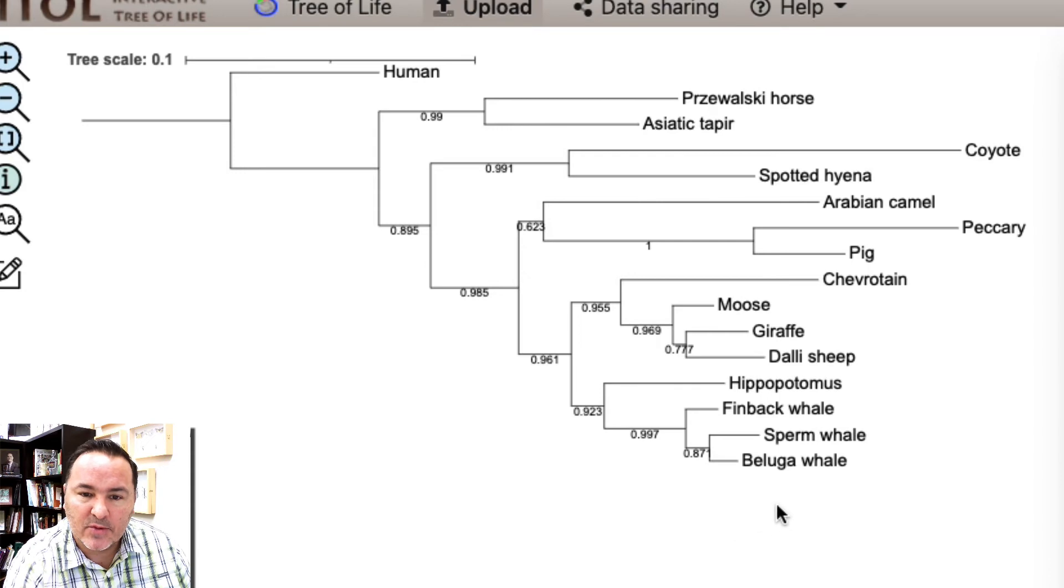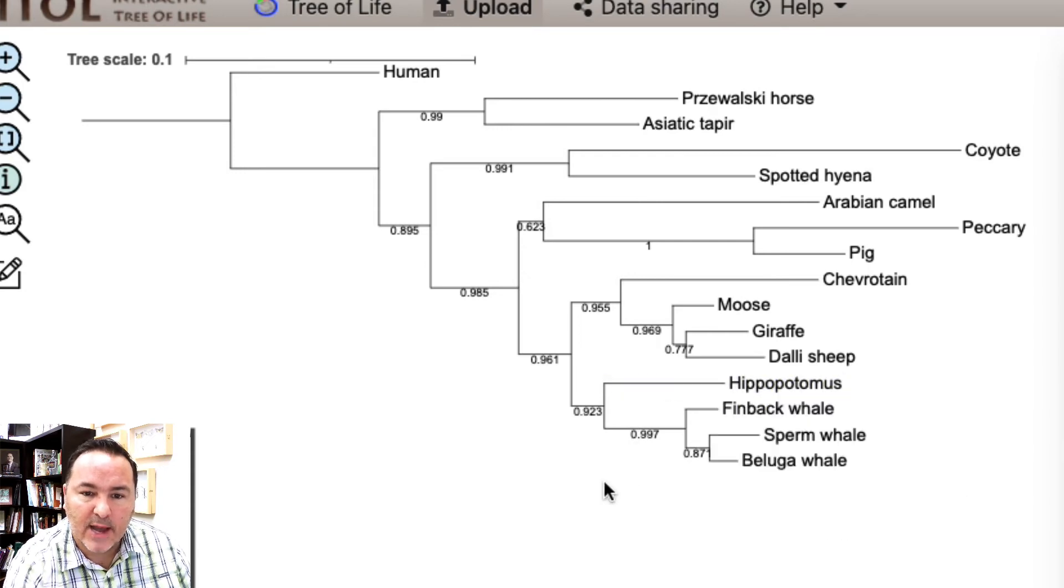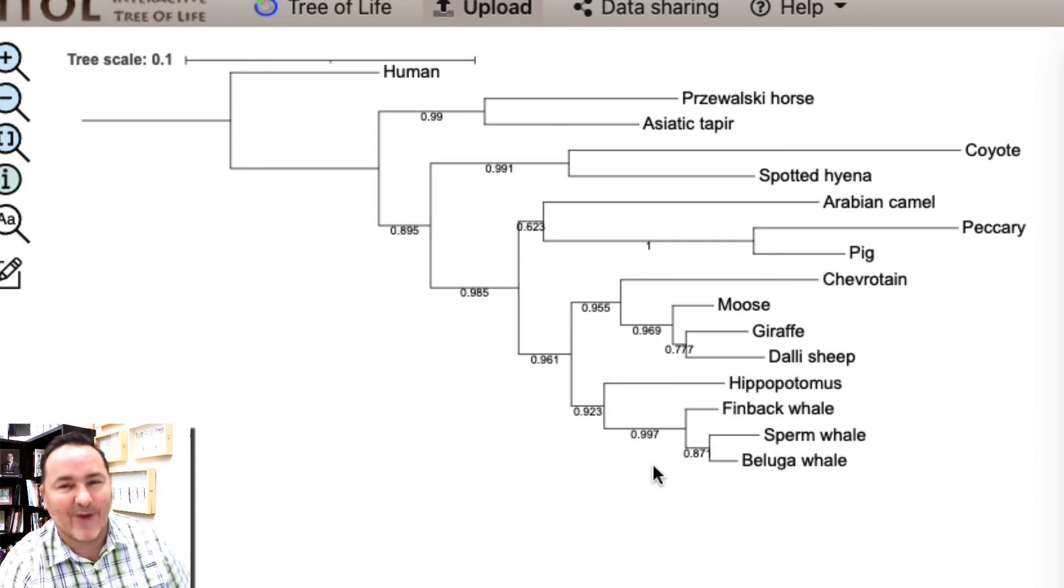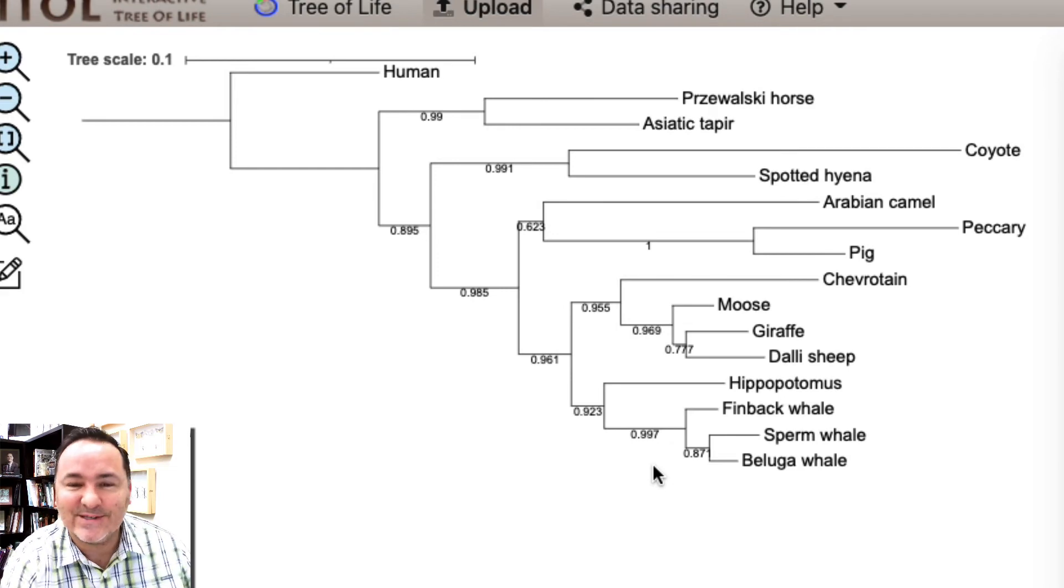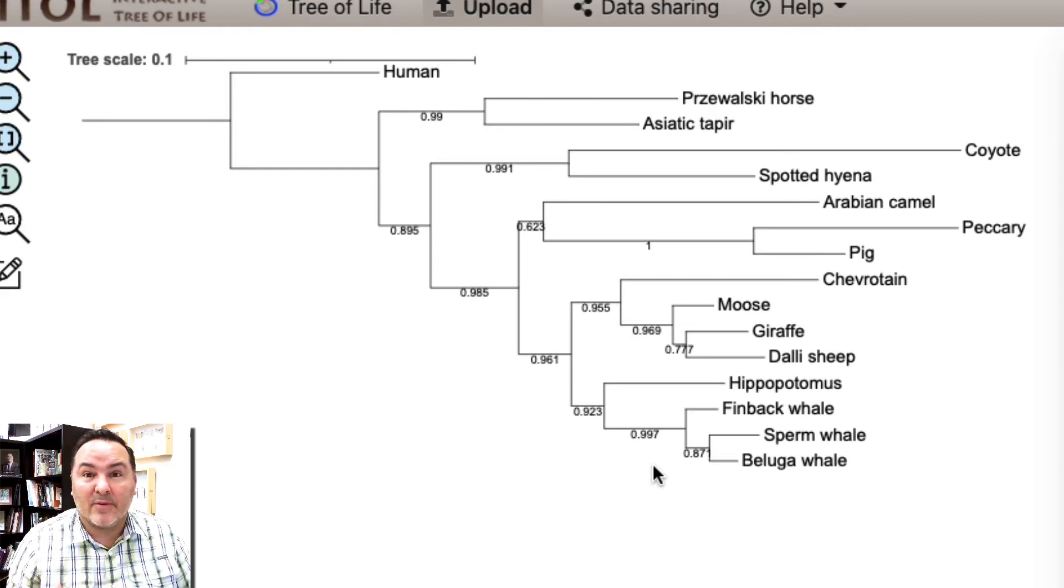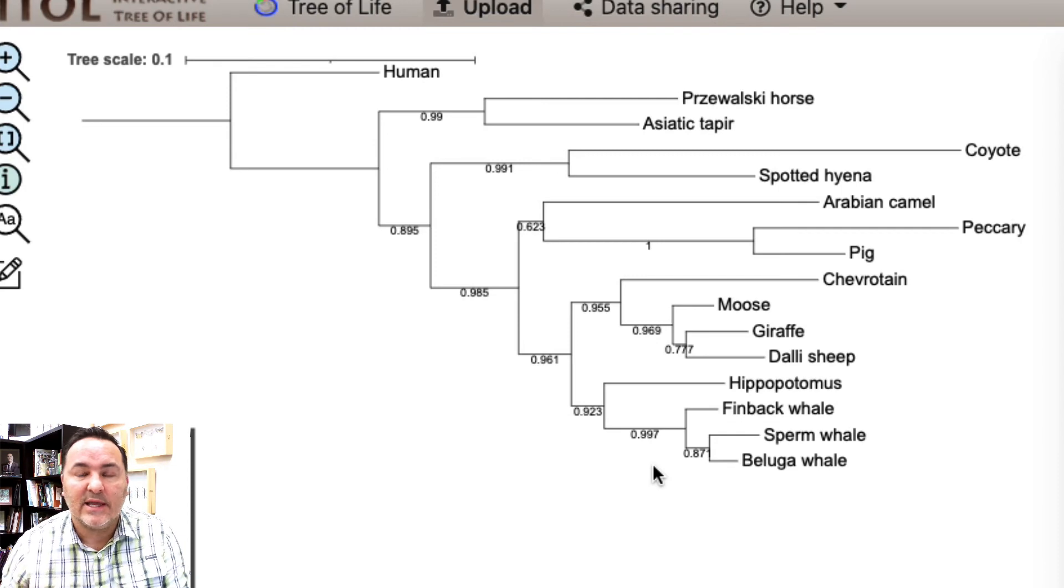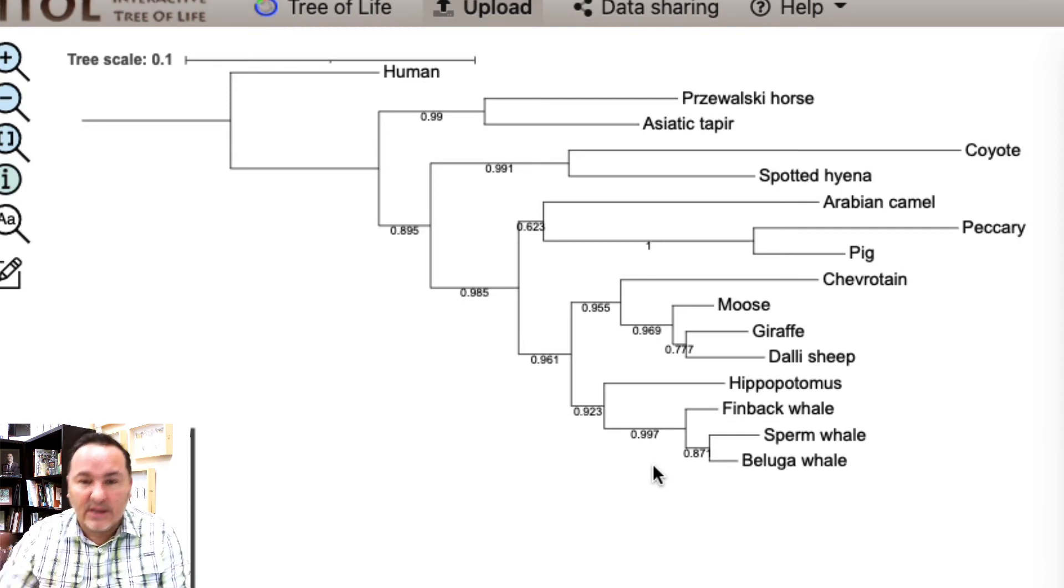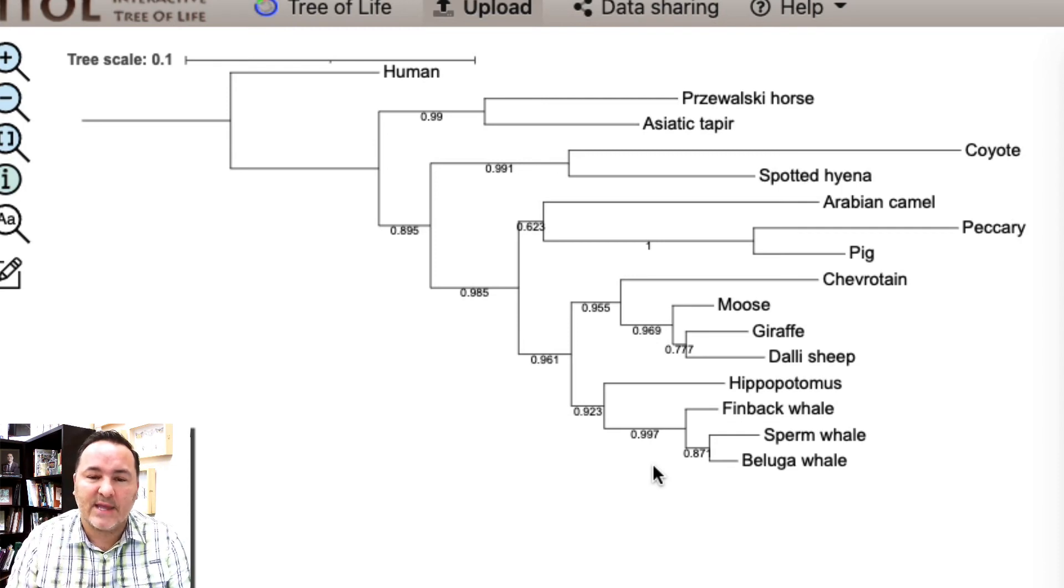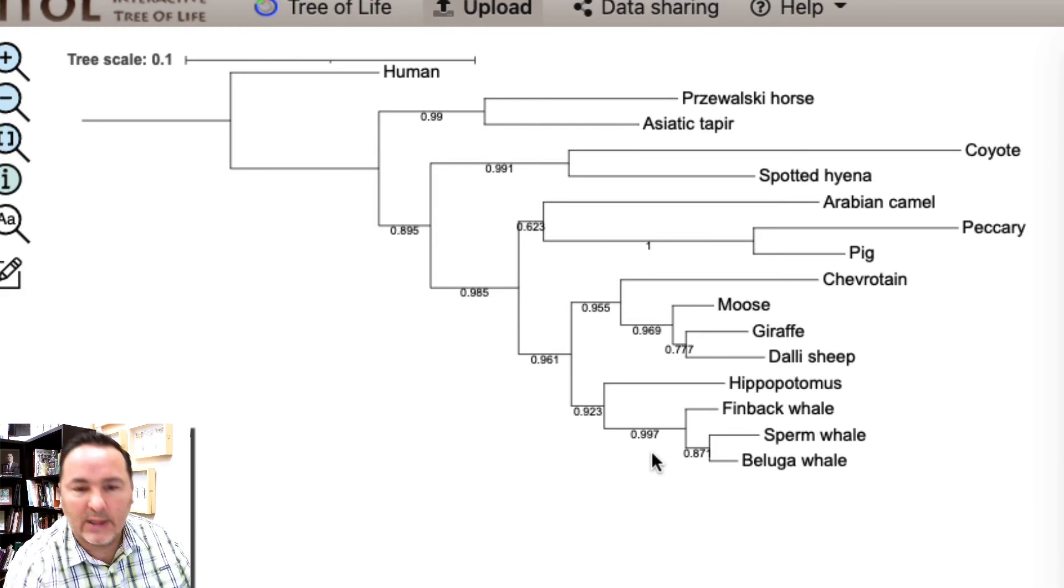Same thing with the whales, look at all the whales down here, 0.997. Almost every single time that they did the data perturbation to look at how statistically significant it is that those three whales are all contained in the same node, really strong support.